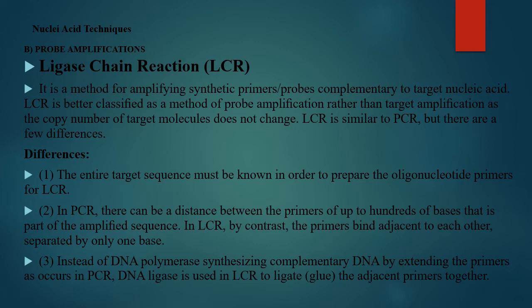difference between the primers. The primers bind at this end and that end and replicate the two strands. We are talking about the distance between them. In the LCR, we have just a one base interval, but in PCR you have hundreds of base intervals.